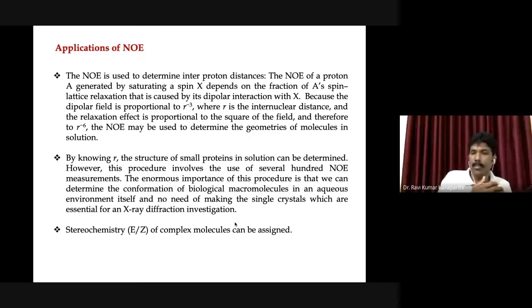Okay, because in one way, as the molecule size gets bigger and bigger, X-ray diffraction techniques we can't use because we can't really grow a single crystal. Only if you have a single crystal can it be used to determine the molecular structure. But as the molecular size increases, it becomes so complex.